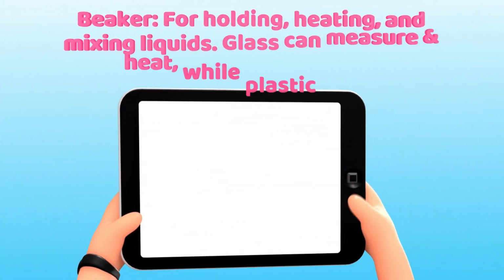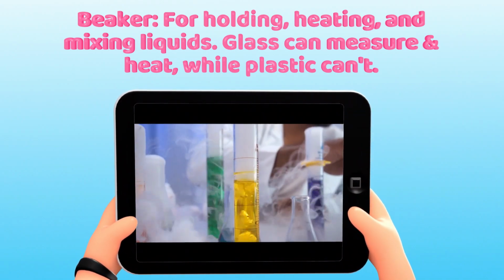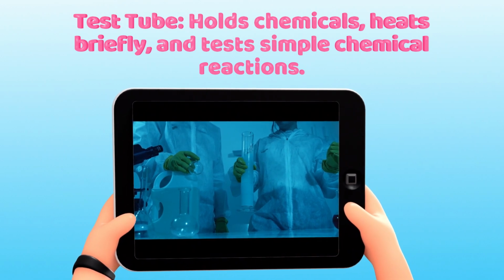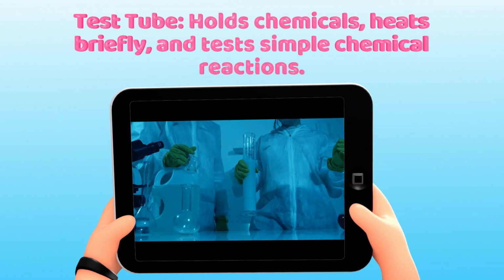Another apparatus is the beaker. This is basically used for holding, heating, and mixing liquids. Another is a test tube. This holds and heats chemicals as well as testing simple chemical reactions.